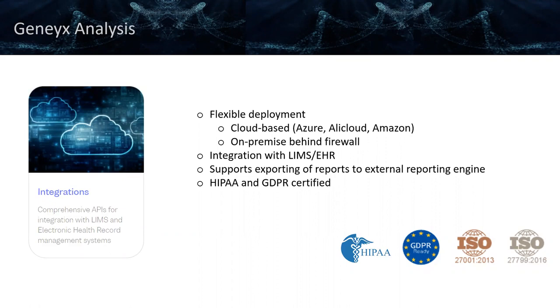But we also support exporting of reports to external reporting engines. We do have a couple of customers that are direct to consumer. So if you wanted to integrate the Geneyx Analysis platform in terms of the reports, we have the ability to create a unique environment that allows you to obtain that.